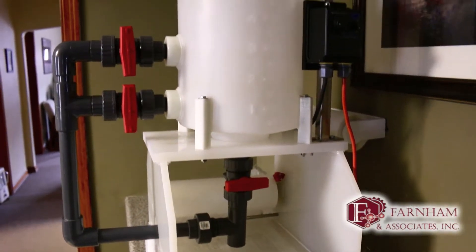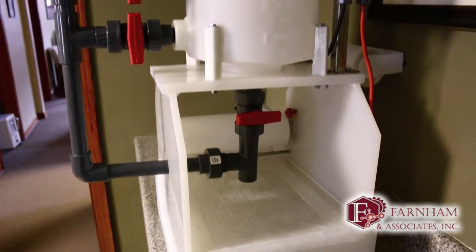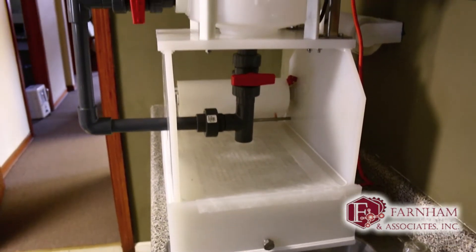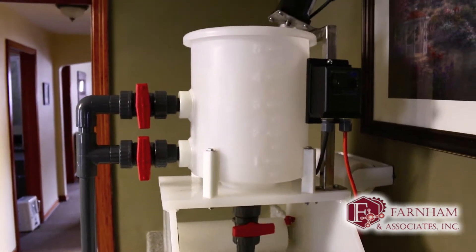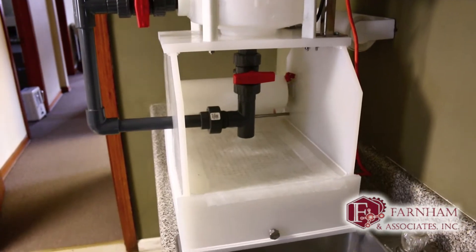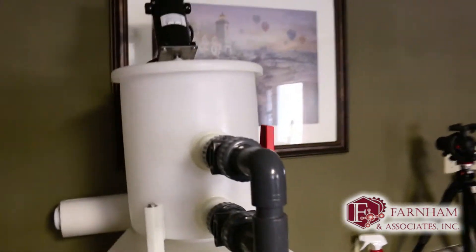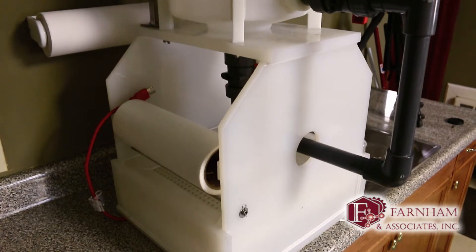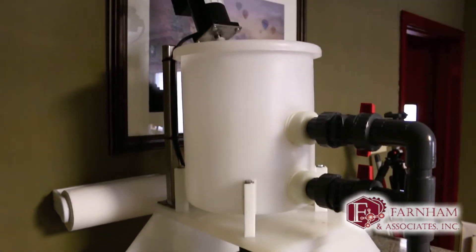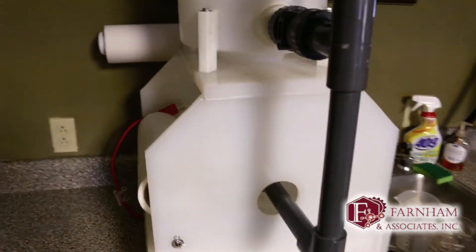This is a deep bed paper filter pilot unit to give us an idea of how the full-size unit will work. This model was designed by Leon Kuznik. I have some wastewater from a cosmetic factory — they're having some issues and we're going to give this a shot. We have some clay product from Wild Bend and we're going to see how that does.